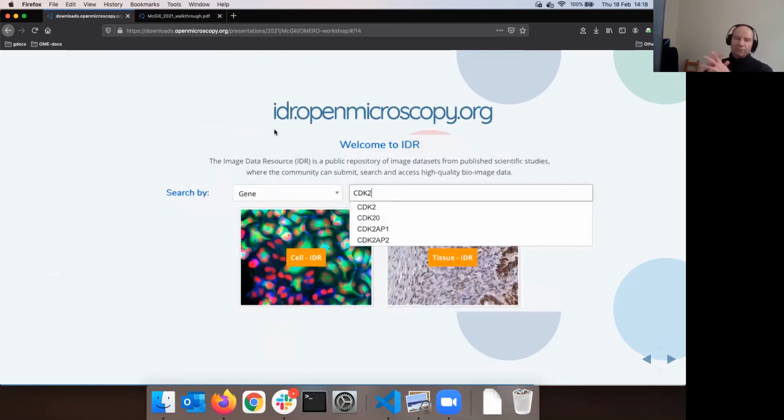This is a little bit of a change of topic, but you will see very quickly why I'm talking about it. That's, let's say, Omero in action, or a production example of Omero called IDR. IDR stands for Image Data Resource, and it is a service which is run by the OME team and publishes imaging data.